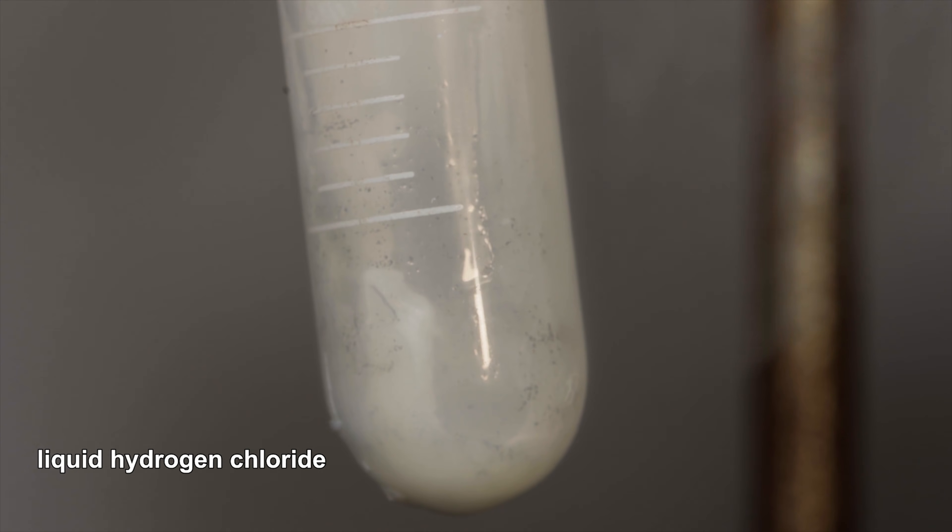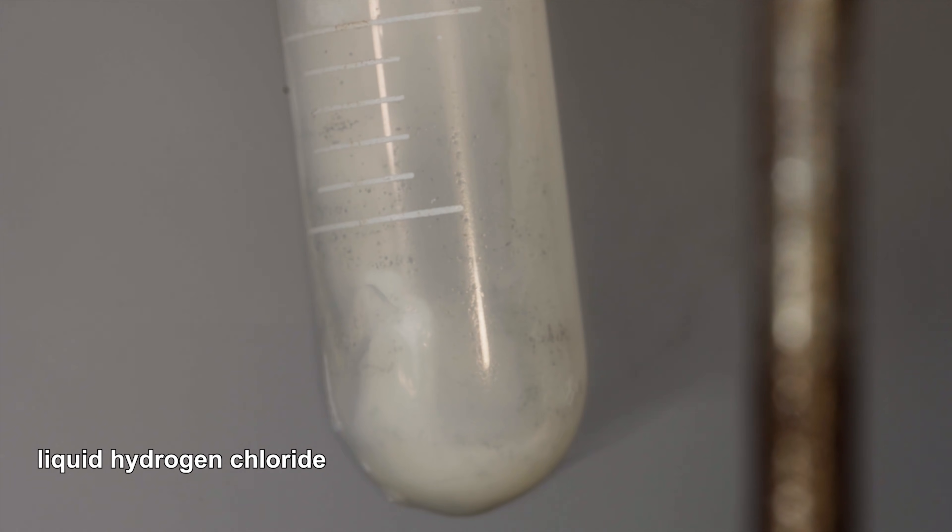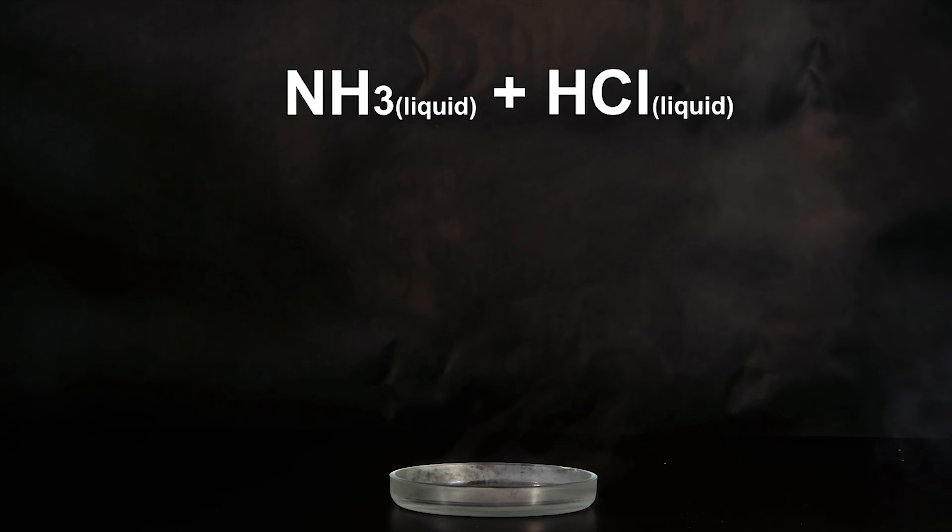To make hydrogen chloride liquid, I had to cool it down in liquid nitrogen. So what will happen if liquid ammonia and hydrogen chloride contact each other?